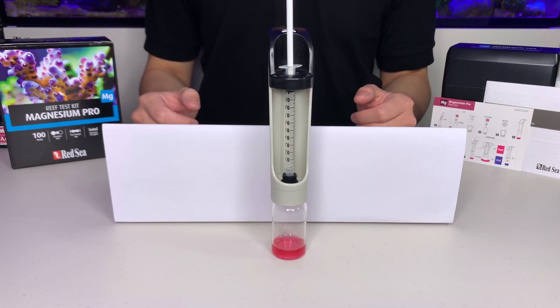For best results, it is recommended to perform the test in light that is as close to daylight as possible. Yellowish or bluish light may affect our perspective on the endpoint color.